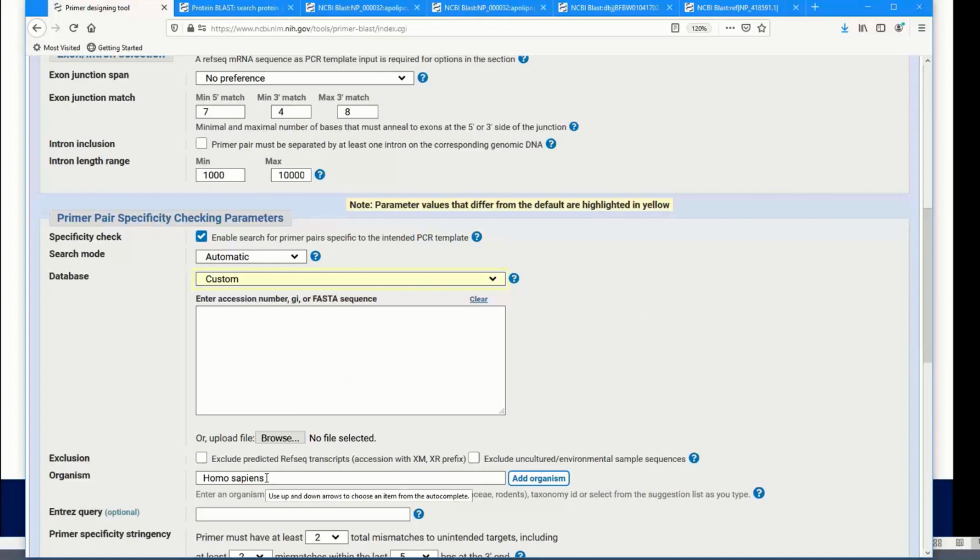And don't forget you need to change your organism down here to what you want to use. So it's possible, but it's probably not as deluxe as you would like it to be. Part of the problem is that the assembly databases are going to get quite large if you start adding a lot of them in there.